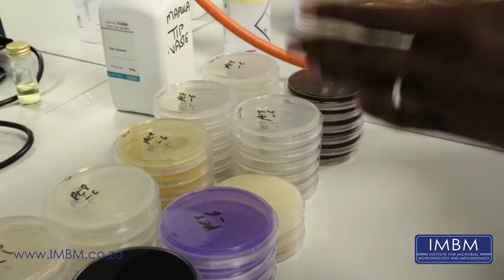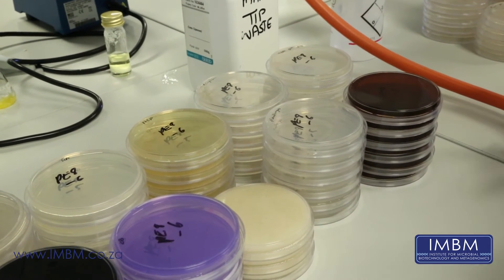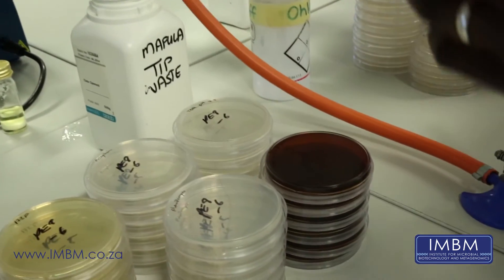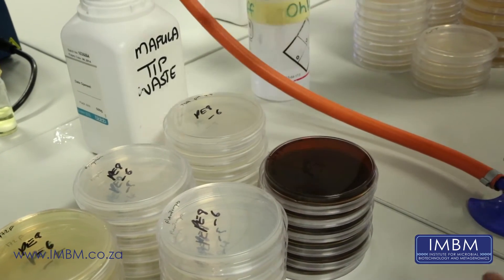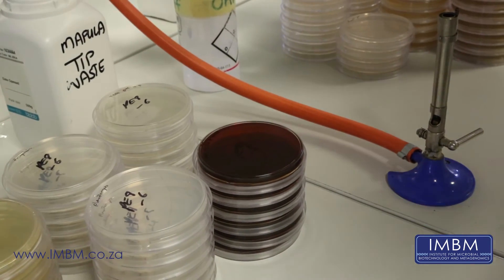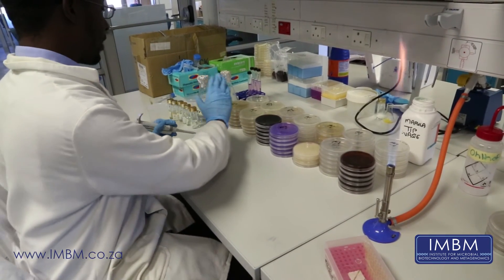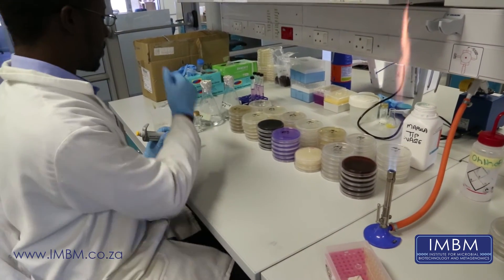Then we have the Actinobacteria, which is a group of bacteria well known to be producers of secondary metabolites among other things. The media here is selected specifically for those. Finally, we've got the low pH media labeled TSA pH 4.5 and the high pH media labeled pH 10. These are specific for acidophiles and alkalophiles respectively. So we will proceed to inoculate the agar plates with the solution in our vials, which is our sponge extract solution.